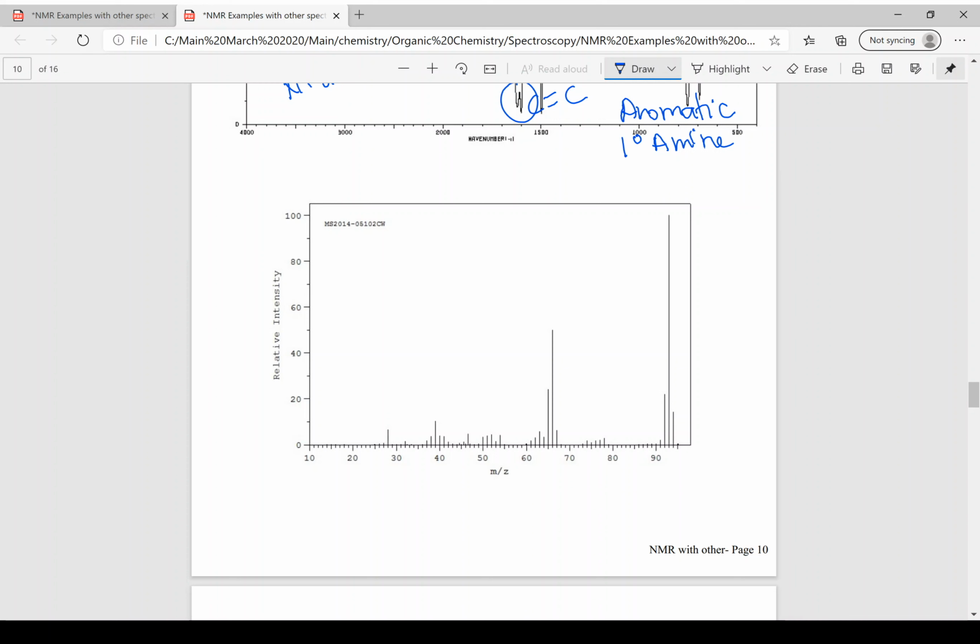Okay. I think that has to be my M+2, so I go back 1. So this is my molecular ion. That makes that M+1. And that's 90, 91, 92, and 93. So the molecular weight is 93, which means there has to be a nitrogen because it's odd. So 93 minus 14, should never trust the math in my head, leaves us 79.